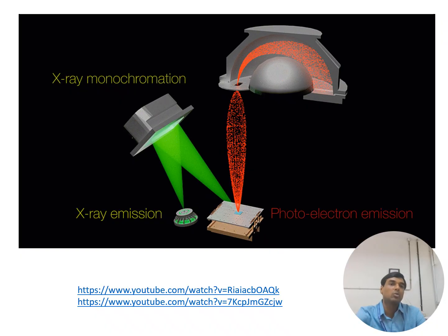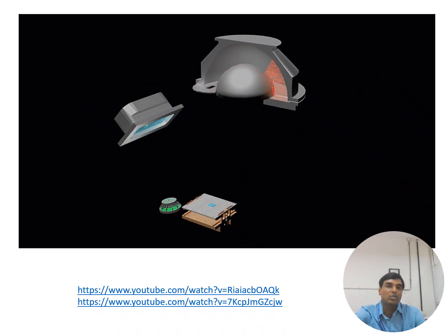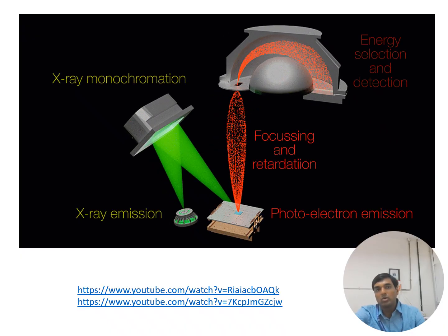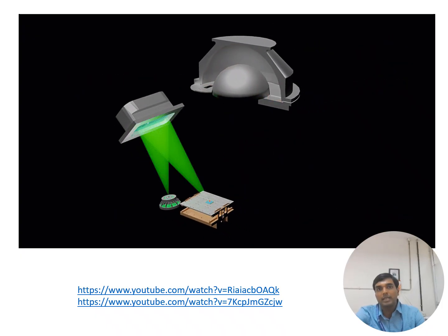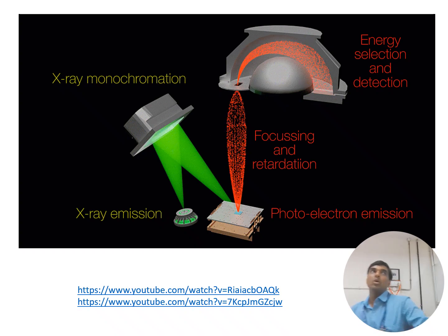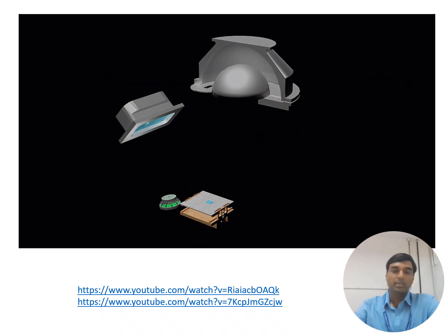It has clearly shown that when a monochromatic X-ray beam falls on the sample, electrons from the sample surface move with different kinetic energy and pass to the detector, and the detector collects all these photoelectrons with different energy, processes them and gives the corresponding binding energy curve, from which we can know what kind of element, what the oxidation state is, and what the composition is.